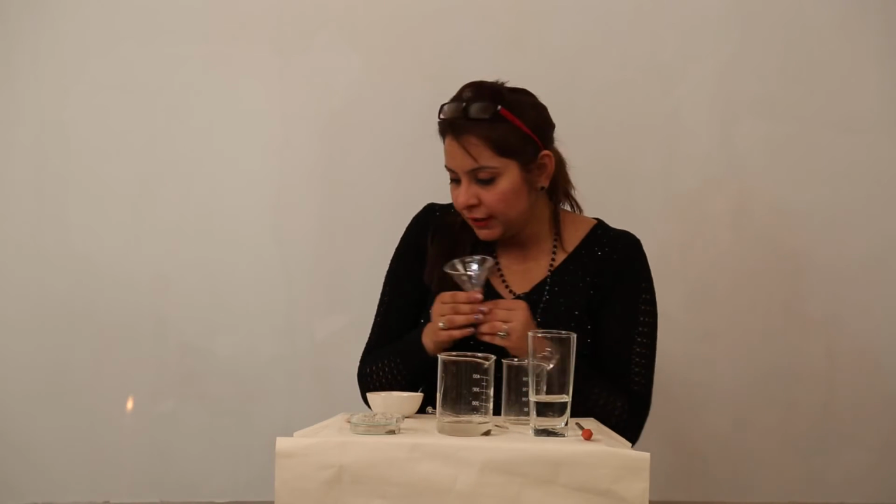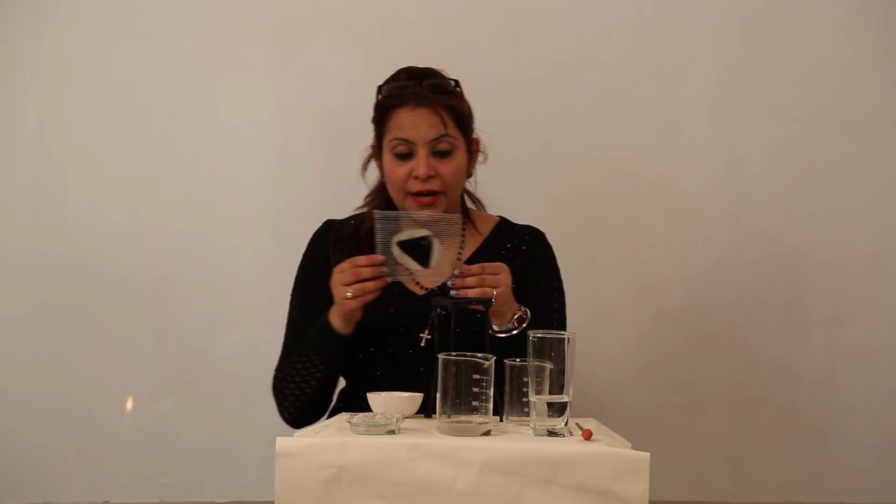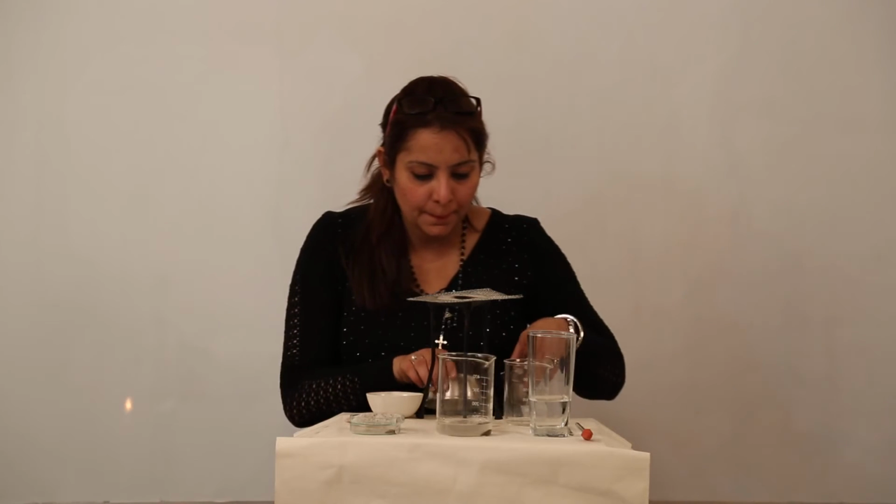So what I am doing, I will be taking a burner, I will just keep the things aside which we do not need. So I am just putting a tripod stand, right. We have a tripod stand. I am placing a wire gauze, because wire gauze has to be placed whenever we need to heat something, right. And I am just placing a spirit lamp as well.